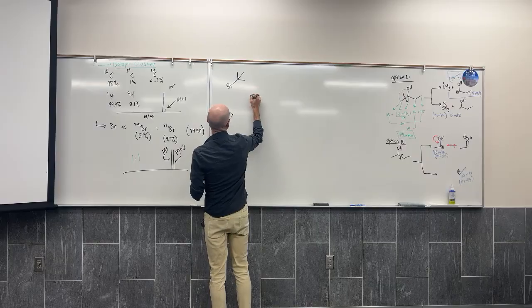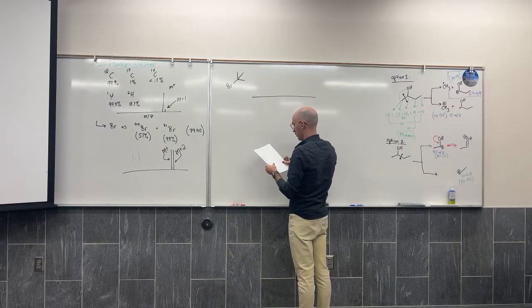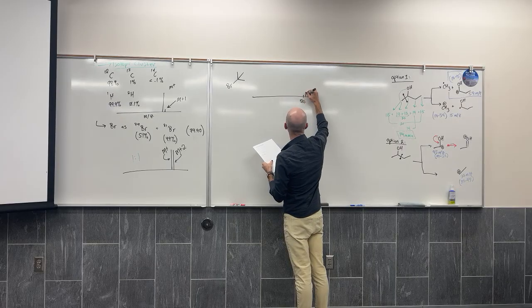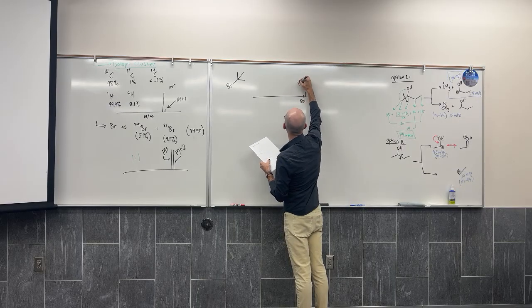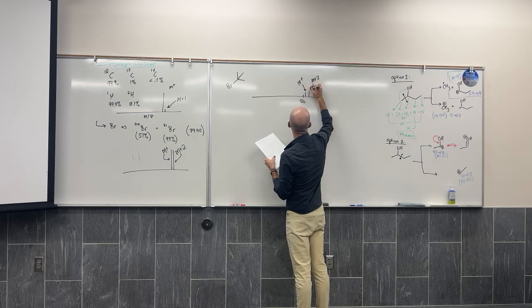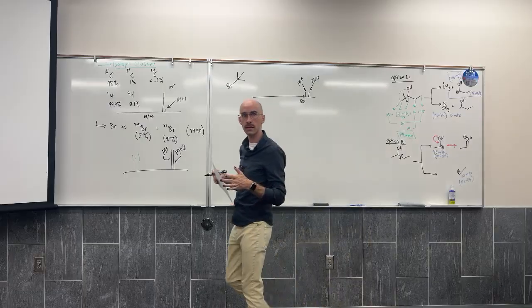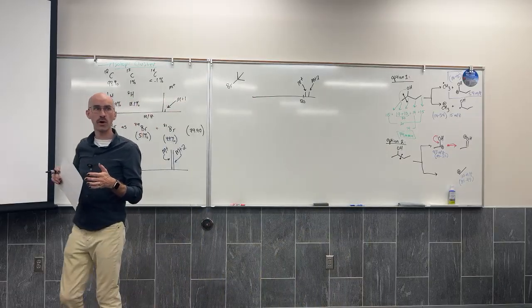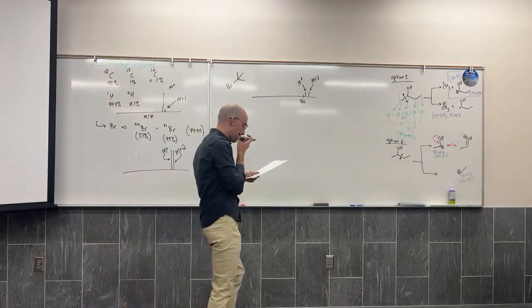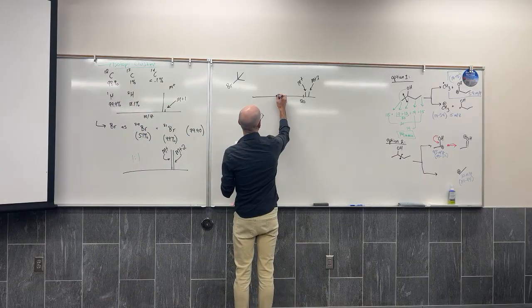Label it as M+ and M+2. Are they the base peak for the spectrum? Far from it. What is the base peak? It's 57.